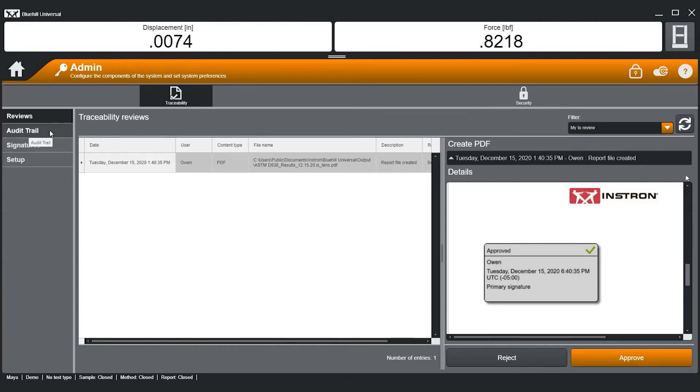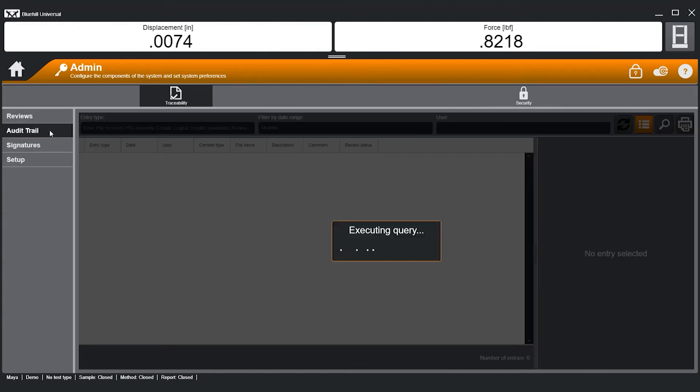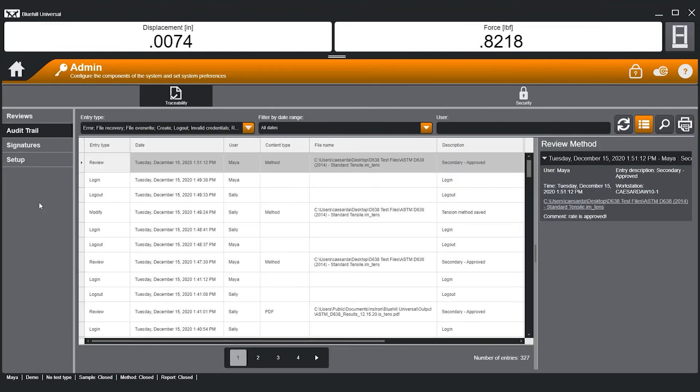Finally, Traceability's built-in audit trail is designed to provide auditors the proof they require to sign off on your lab's data integrity. Here, users can view or print the audit trail, which includes system-level usage, as well as file additions, modifications, and deletions.